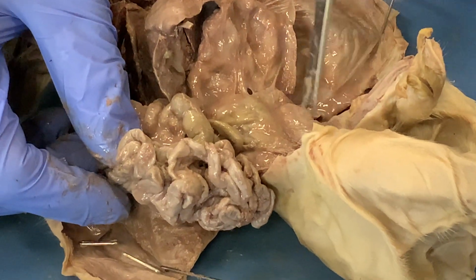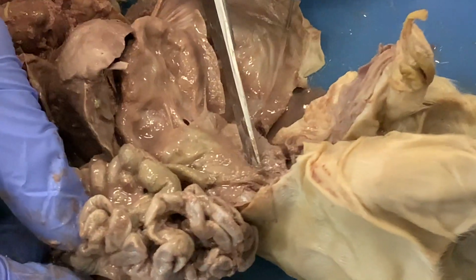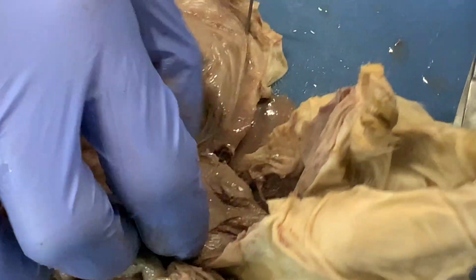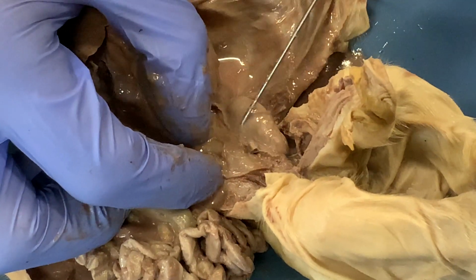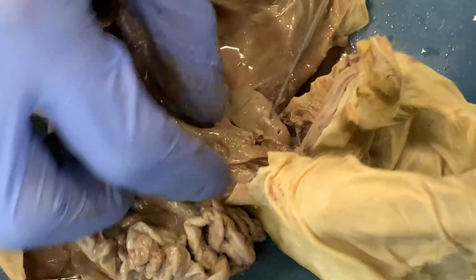In the very back, there are two bulges that are kind of hidden behind another layer of membrane and against the dorsal or back side of the abdominal cavity. If we take that membrane and lift it away, we can expose a kidney. That's this structure here.